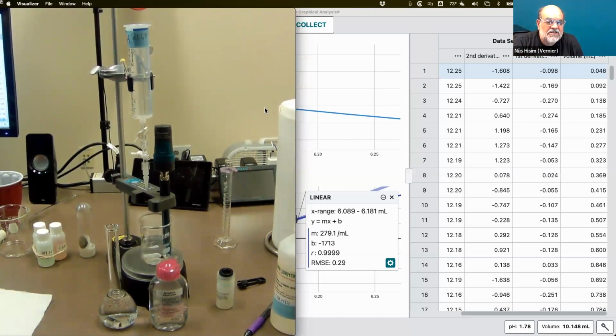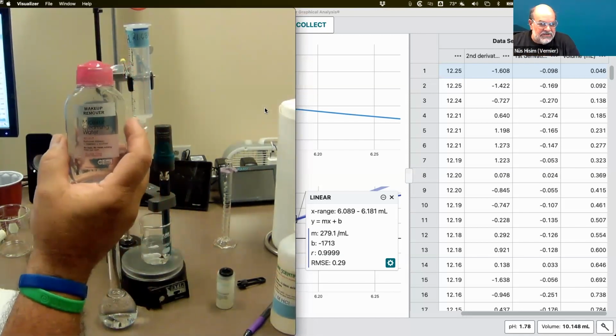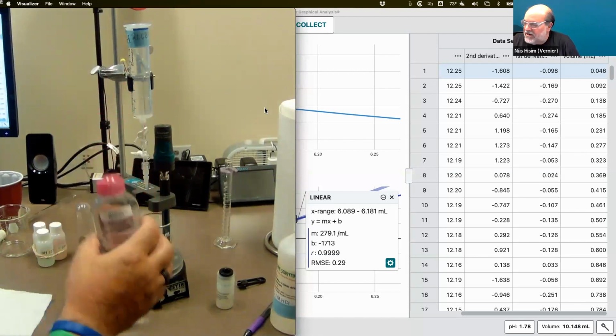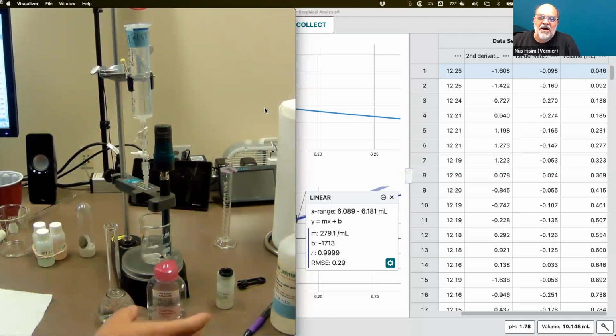What is the acid concentration? Christina, I was being conservative, and I kept the contaminated sample at right around 2 molar. It's in the teacher's guide, which walks you through making a 2.1 molar solution. I didn't want to make it exactly 2; I wanted it to be a little bit of a mystery. The idea was that somebody came by and dumped a handful of sodium hydroxide into here. But you could use a higher concentration. I just feel uncomfortable depending on the level of the students. With a higher level class, wearing gloves and being careful, maybe a 3, 4, 5 molar solution would be okay.